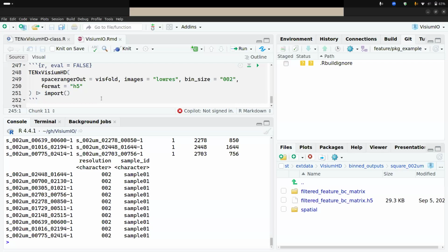This question is because I'm not dealing with the HD stuff, but the matrix of the counts is either an MTX or what's the parquet? The parquet is part of the colData. I think they say the colData is a parquet file, so basically the coordinates of each spot.